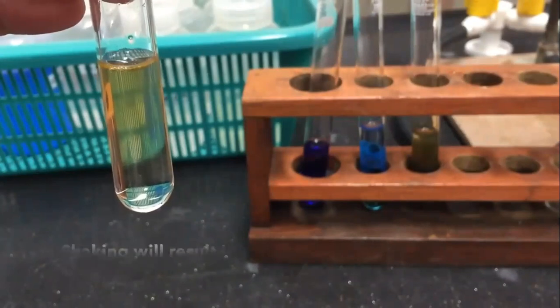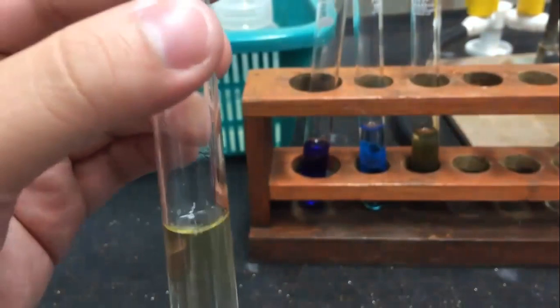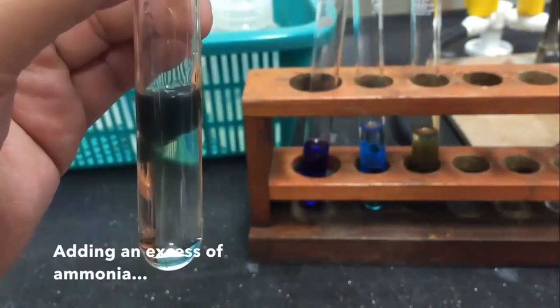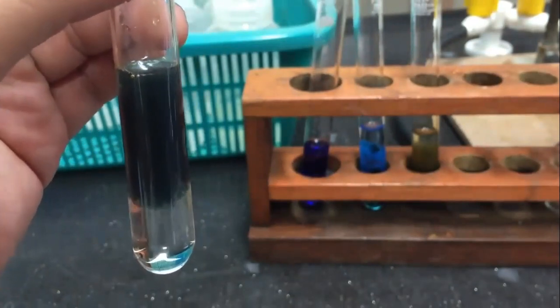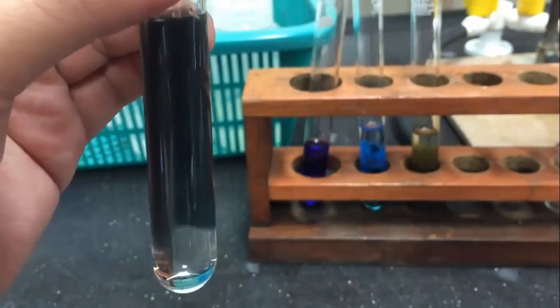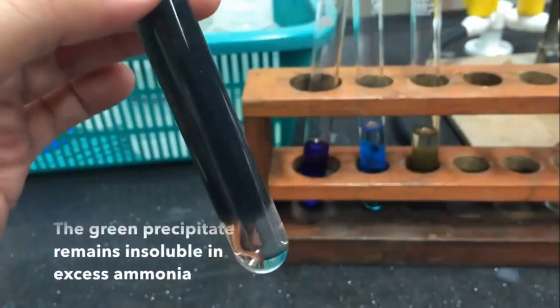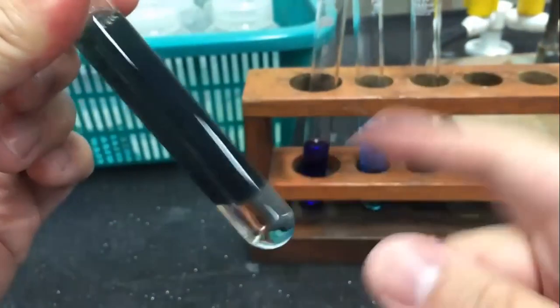What actually happens is that the green precipitate is dispersed into finer particles throughout the solution. To obtain a clearer result, continue to add excess ammonia. If the result is clear, the green precipitate remains insoluble in excess ammonia.